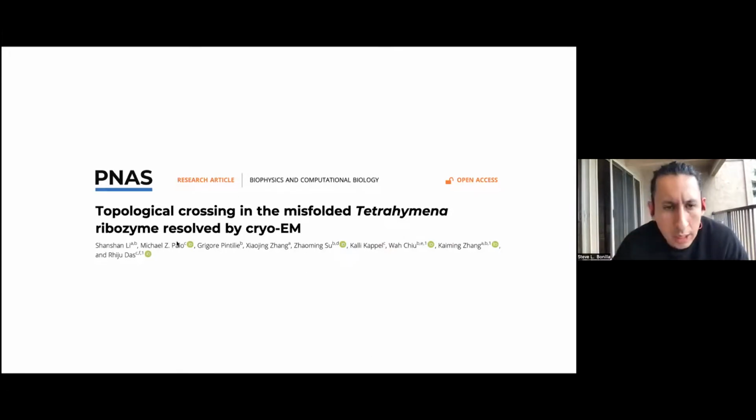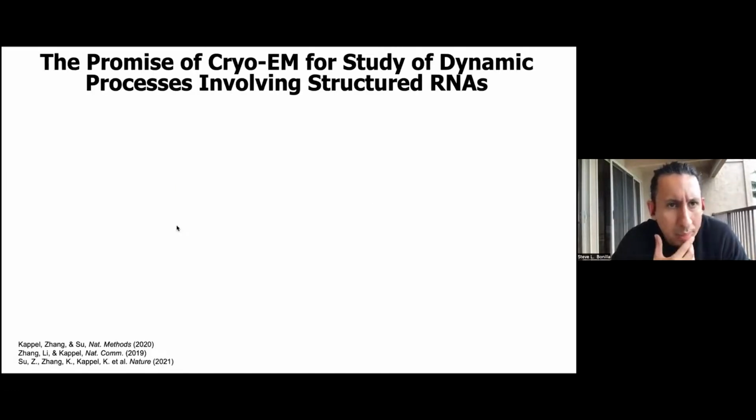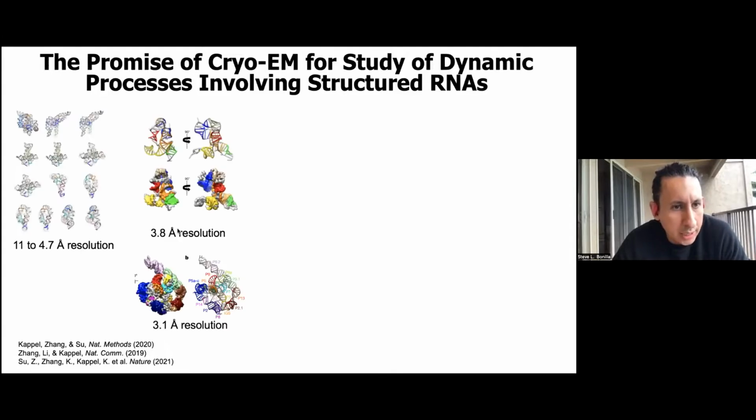So just to close this, I wanted to go into what the promise of Cryo-EM is for looking at these dynamic RNA structures that had been elusive for a very long time. We're seeing an explosion, and I think it's just going to keep going faster. We've seen all the structures both from our lab and also from Wah Chiu's and Rhiju Das's labs, and there are other groups.